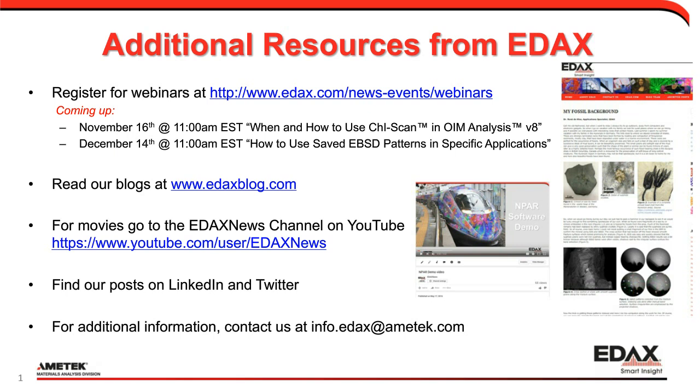You can also reduce the Bremsstrahlung for quantitative mapping. How we do that is with a map we call the net intensity map, which, for each pixel, does a peak to background fit and subtracts out the background. That's going to give you better signal above noise for your map display.